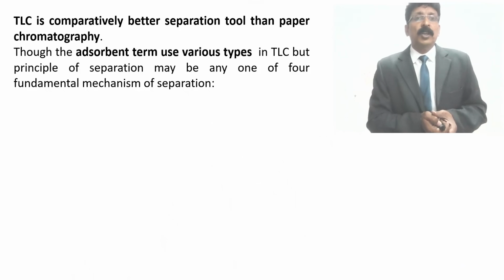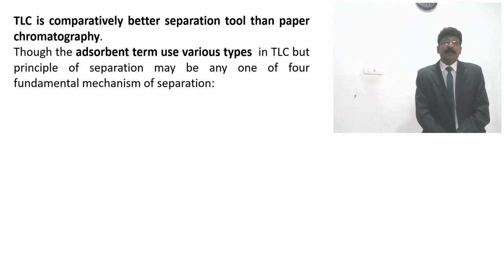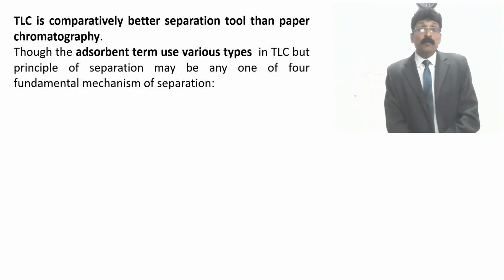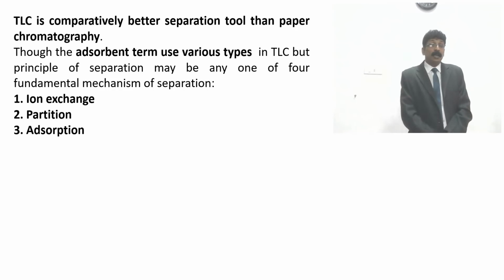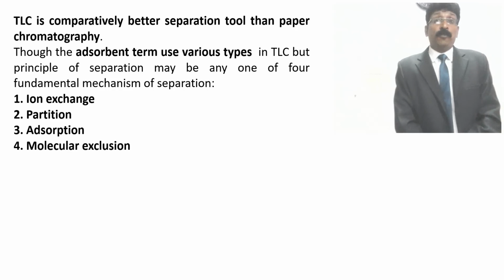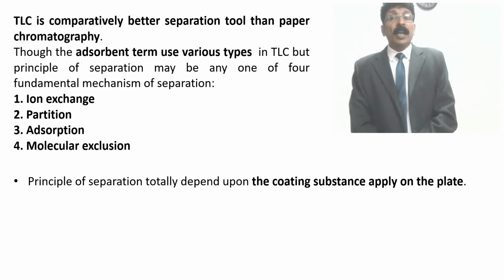Though the adsorbent used varies across types of TLC, the principle of separation may be any one of the four fundamental mechanisms. Ion exchange chromatography can be followed, partition can be followed, adsorption can be followed, molecular exclusion can also be followed, by changing the stationary phase. So you just see how it is possible in thin layer chromatography.